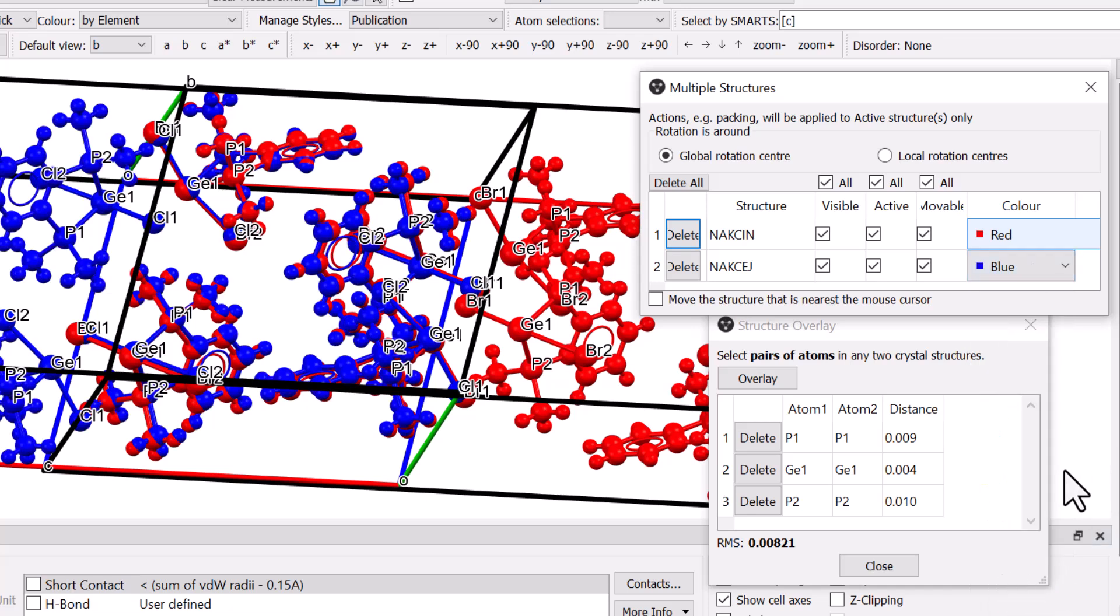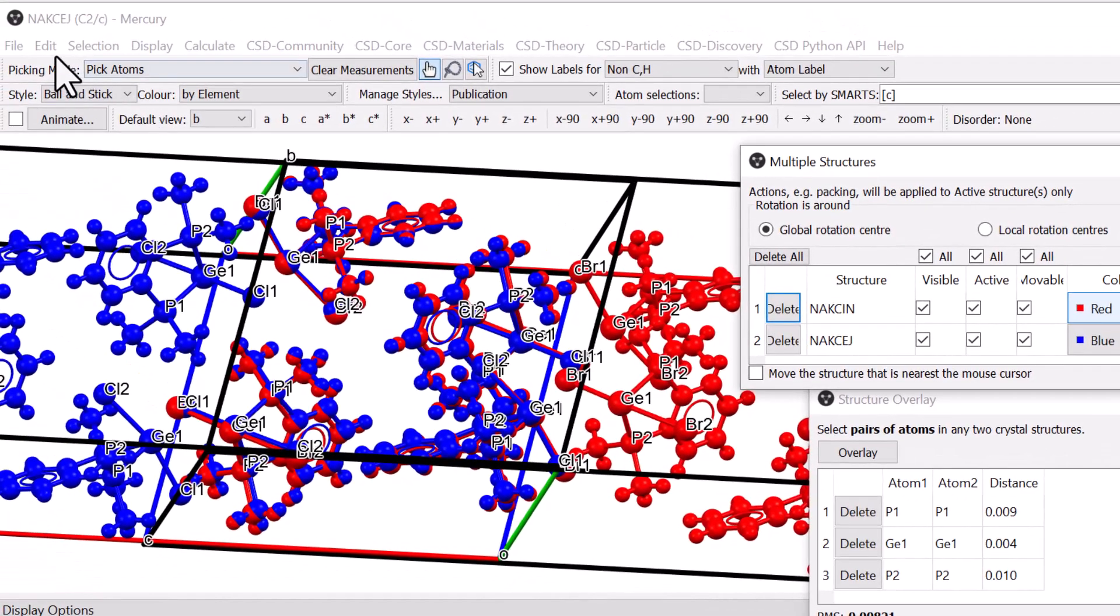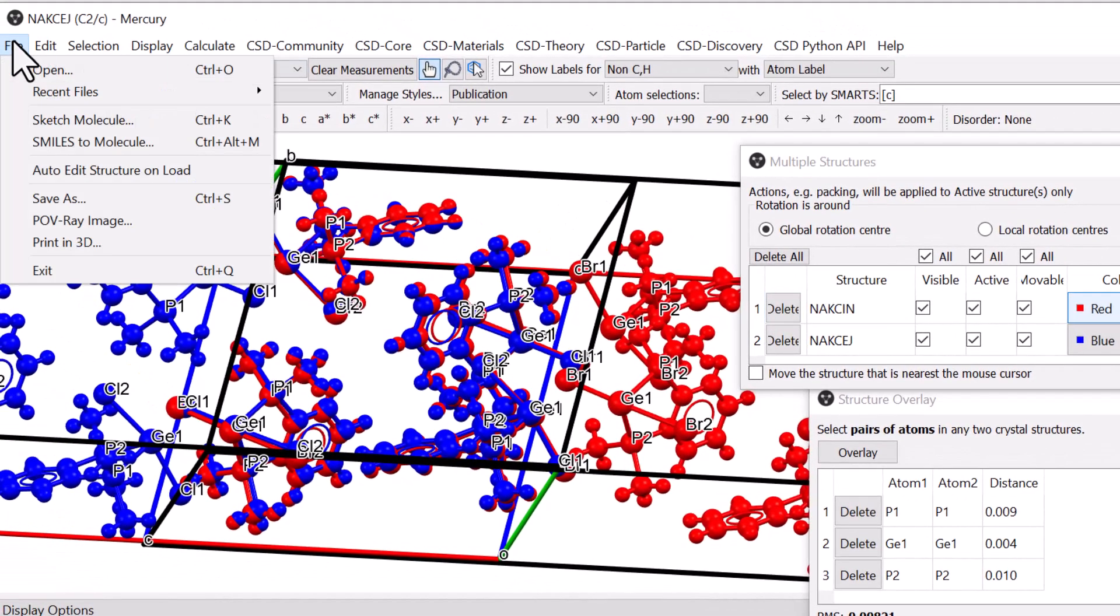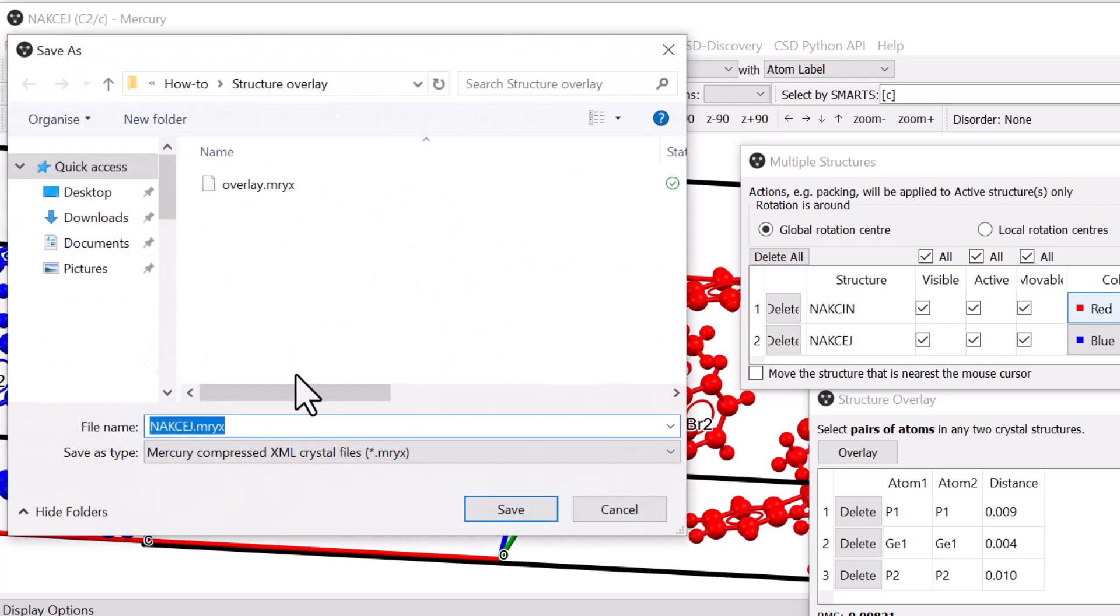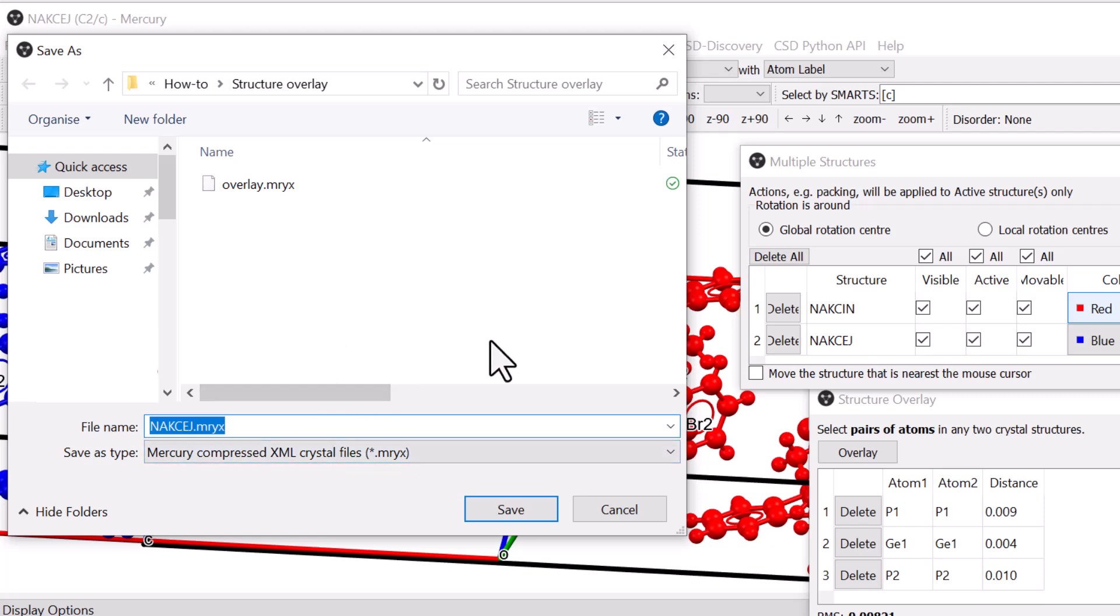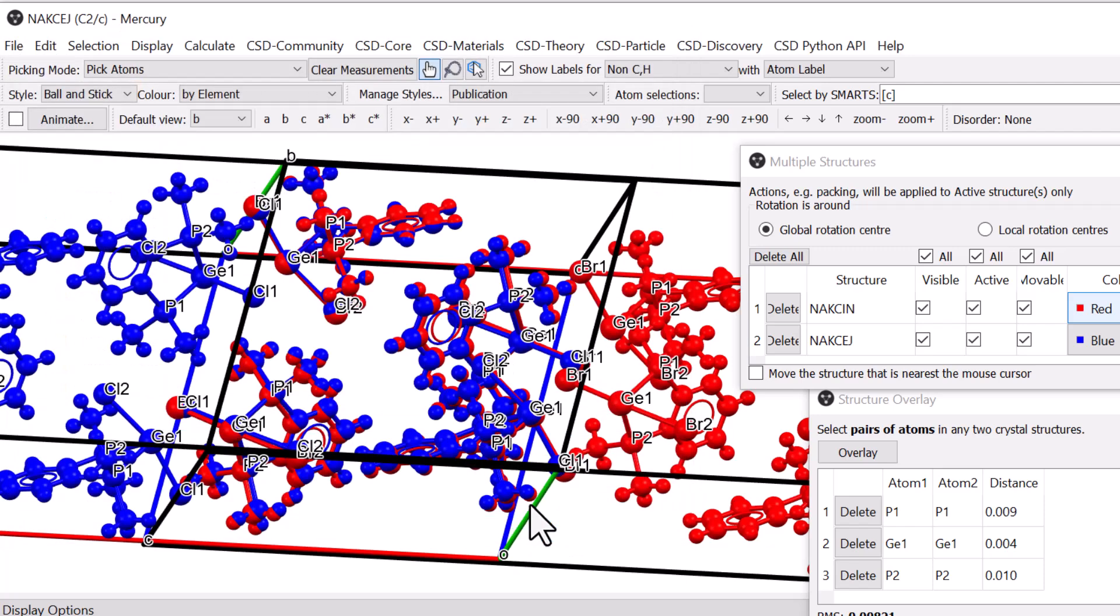It is also possible to save the Structure Overlay to continue working with it in the future. To do so, go to the File menu, select Save As and choose an appropriate directory. Select the file type as .mryx and click Save. This can be reopened via File and Open from the top menu.